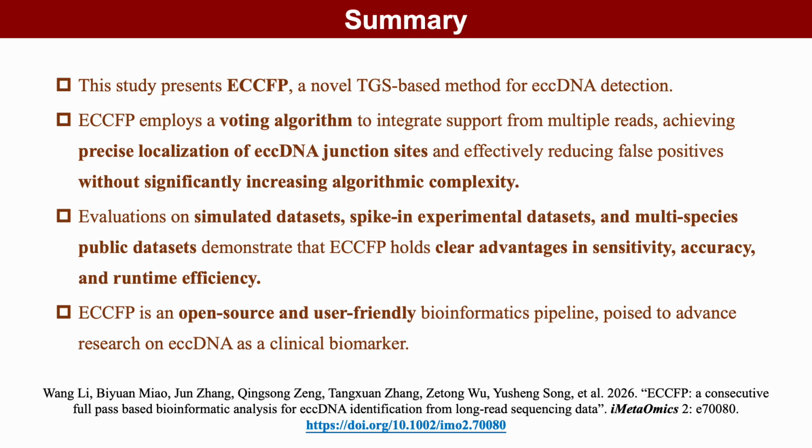and then consolidates candidate eccDNAs into accurate unique eccDNA by the Boyer-Moore voting algorithm. ECCFP demonstrates significant advantages in sensitivity, accuracy, and runtime efficiency. As an open-source tool, ECCFP may provide a promising tool for eccDNA study.